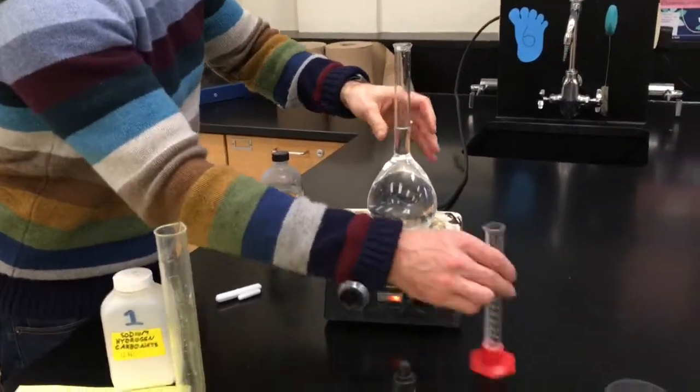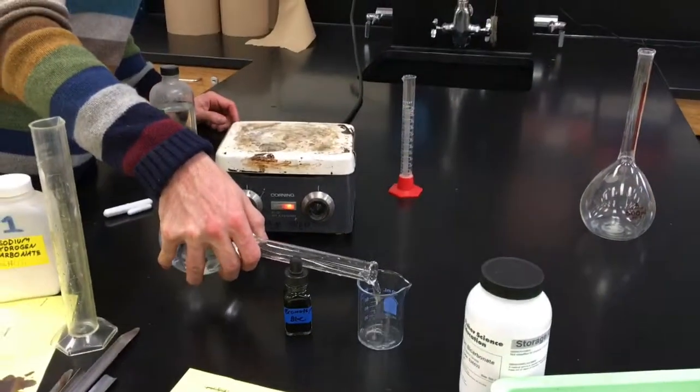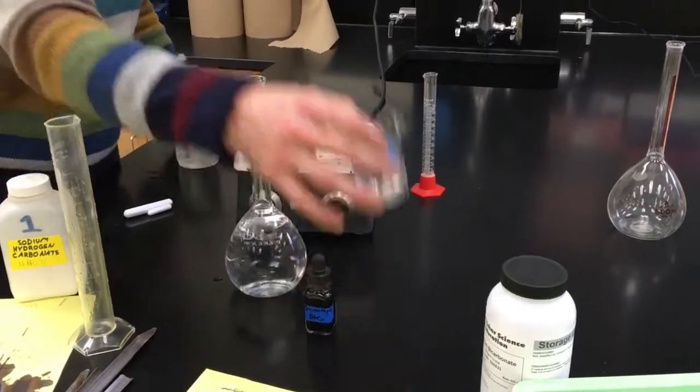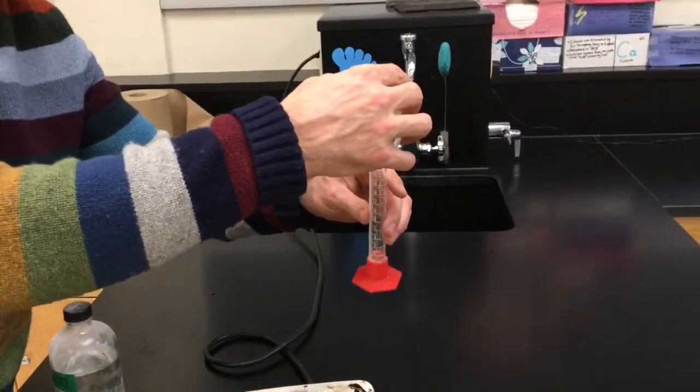So I'm going to pour 18 mils and have that ready. Now it'll be in a little beaker at your lab station, so you'll see it there, so it's a little bit easier to pour. Because I don't want you to pour from the volumetric flask. It's a little tougher. But I know Thor Sizzle can do it. But anyway, I'm going to pour 18 and just have that sitting ready.